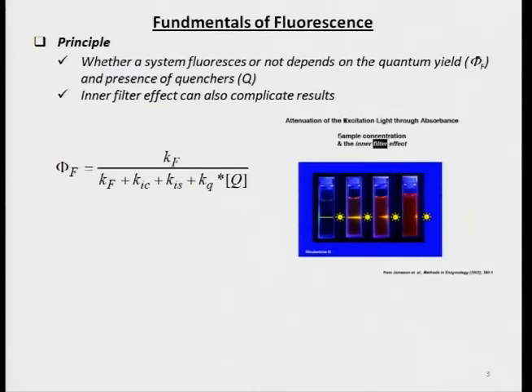This is the high concentration inner filter. And then when you put in your ligand, you dilute the solution, and suddenly you start noticing that the intensity increases. And then you might end up thinking, gee, I have a beautiful effect. But then when you do it at a different concentration, you have a different effect. And then when you dilute, you have no effect. And 3 months down the drain. So you have to be careful about the inner filter effect.